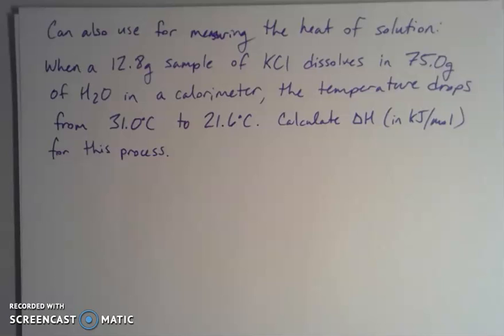So I used my calorimeter. This is another way I could go about doing it. I divided my energy or my heat by the amount that I used, and then that gave me some information about this chemical process. So another important application of calorimetry.